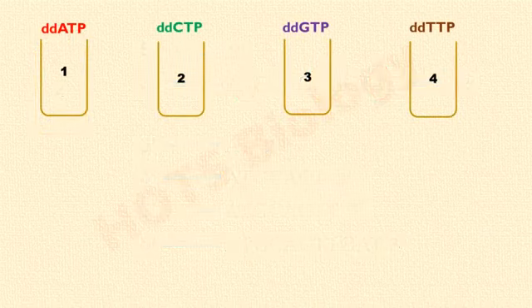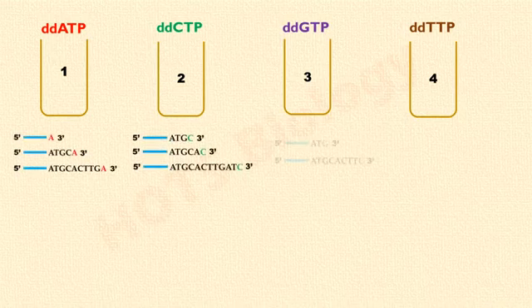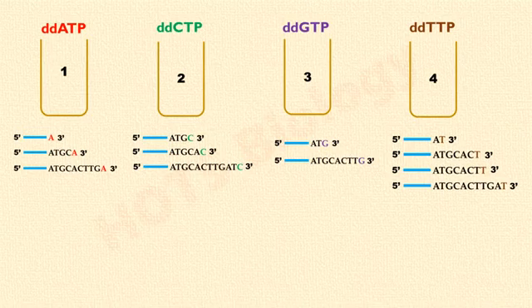Upon the completion of the 4 parallel reactions, partial replication DNA products will occur for every nucleotide in the template. That means each reaction now has a set of DNA fragments that have the same starting point but different end points.